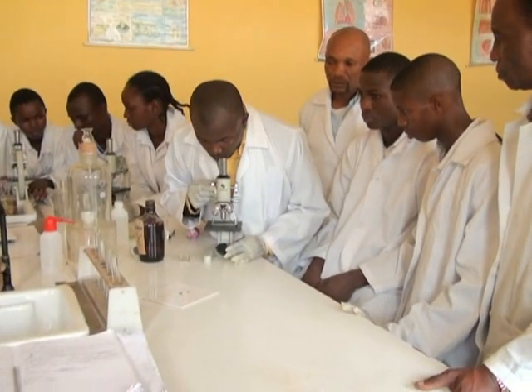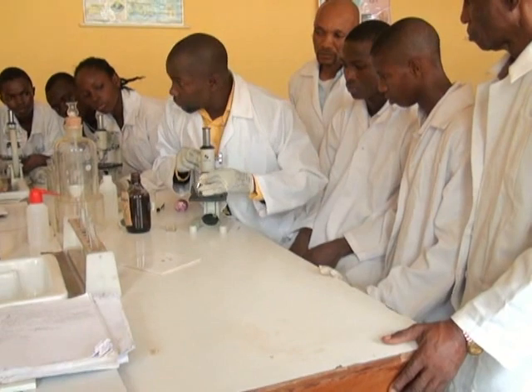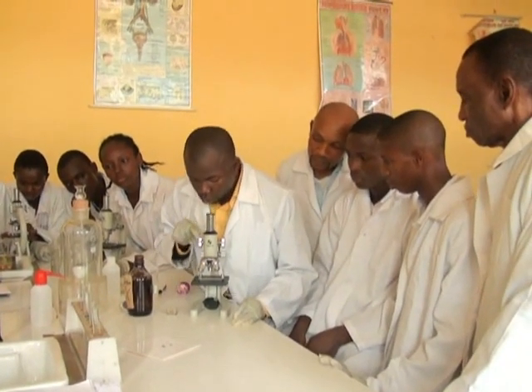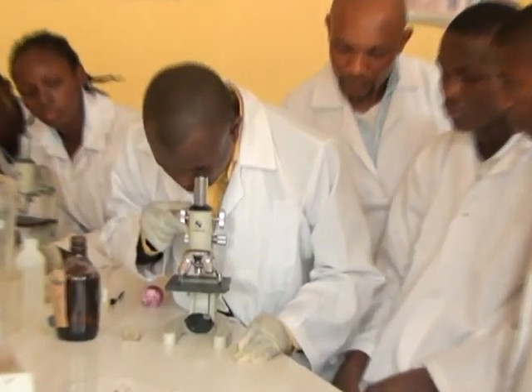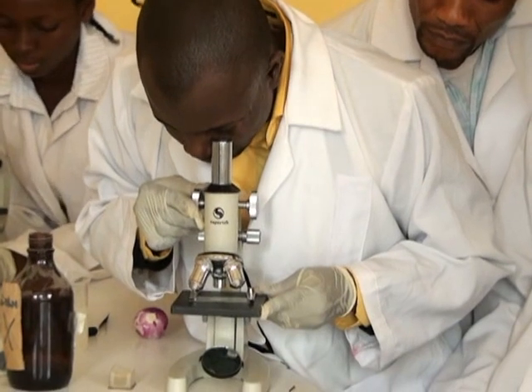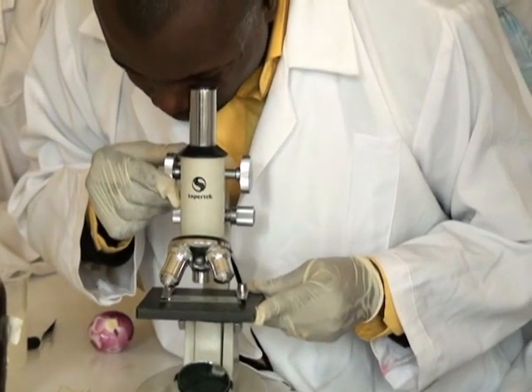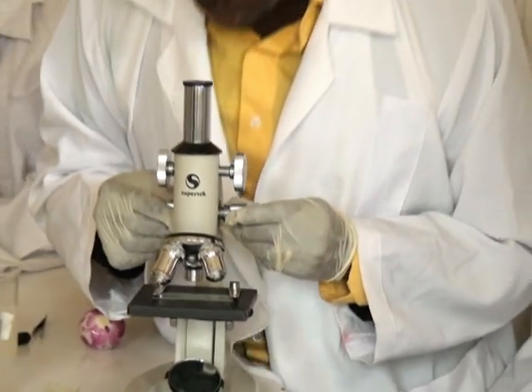Then, while viewing through the eyepiece, you adjust the objective. These are called the objective lenses. Use the revolving nosepiece and swing into position the low power, times 10 is the lowest power. And you use the coarse adjustment knob to bring the specimen into initial focus. Then you raise up the stage, bring the objective lens down and up until you bring the specimen into view. As soon as you get the view of the specimen, you use the fine adjustment knob to bring it into sharp focus.